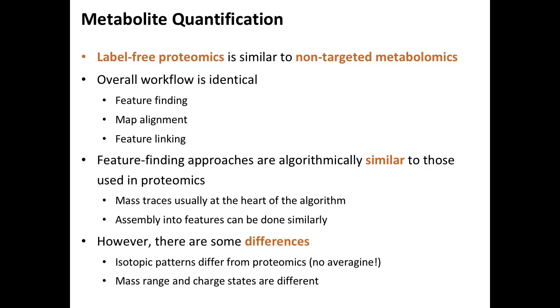Feature finding approaches are algorithmically similar to what we do in proteomics, but the algorithm I'm going to present here, that is the feature finder Metabo in OpenMS, works in a slightly different way than what I presented this morning for proteomics. It's sort of a different evolutionary stage of this algorithm that was published a couple of years back.